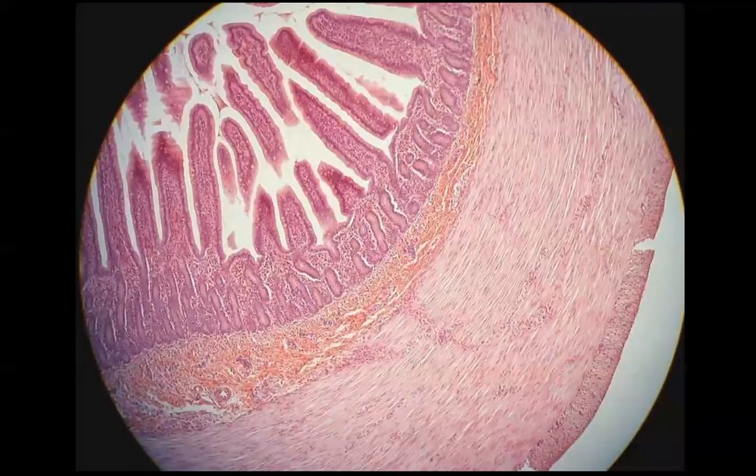This is a section of the jejunum. So up here, all of this is that really tall villi. So really tall villi that are responsible for absorption. You know you're in the jejunum. Down here in the submucosa, nothing interesting going on, no glands, no Peyer's patches. So you know you're in the jejunum. And then the muscularis externa here.